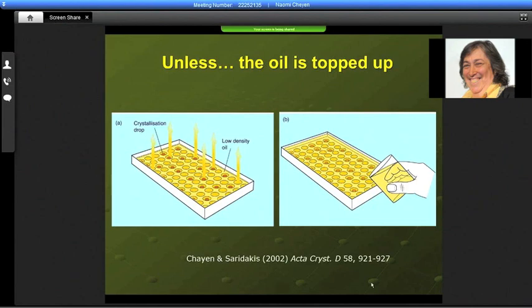So you look at the crystals, you get the hits, and once you get them, before they dry out and just precipitate or dry completely, you can top up the oil, either with the paraffin or silicon paraffin. But that means actively following the trials almost every day. Otherwise, you can lose a lot of drops to drying out. Whereas with the paraffin, this doesn't happen. So again, some people swear by the mixture of oils. Some people, like me, actually prefer the paraffin.